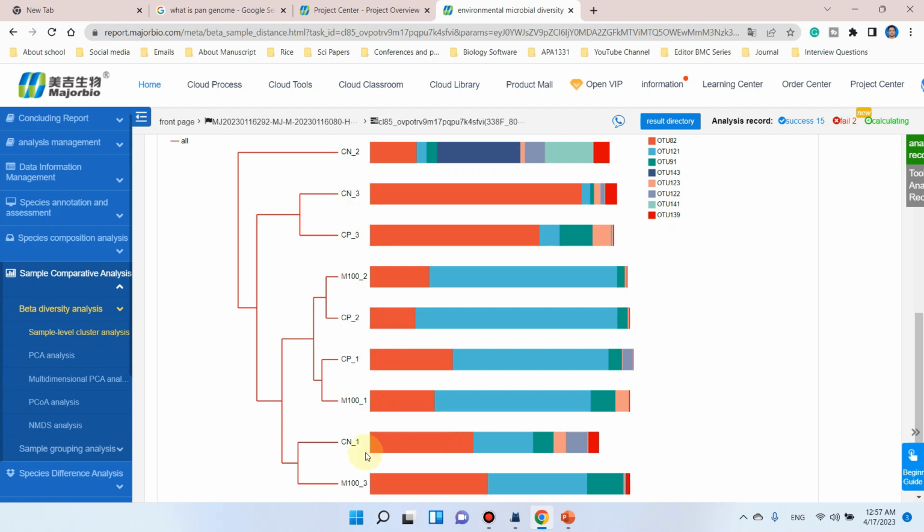They should have named control positive 3 as control negative 3, because all the control negative samples should be in one group, and similarly the control positive should be in one group. But here you can see control positive 3 is overlapping with these two, and probably this is a sampling mistake. Anyhow, our concern in this video is only to understand the trend.